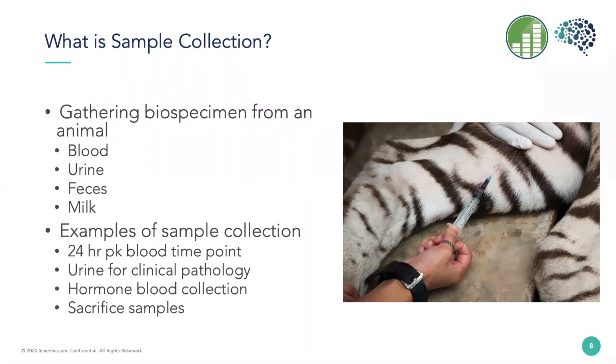Samples can be collected for many different purposes, and some are time dependent, such as blood drawn from animals on a study at certain intervals pre and post dose with test article. We call these time collections and the individual blocks time points, and some samples must be drawn during a certain window of time that's related to maybe sleeping or waking cycles, or even within a certain window of time after a technician enters a room.